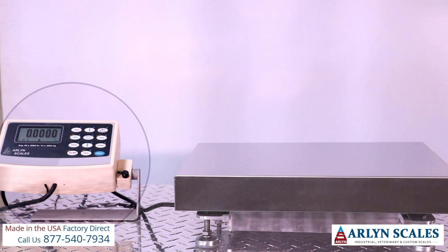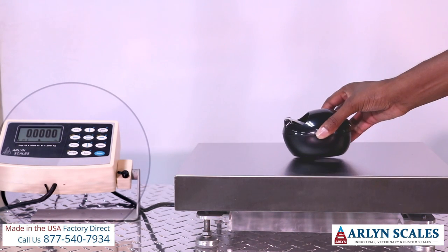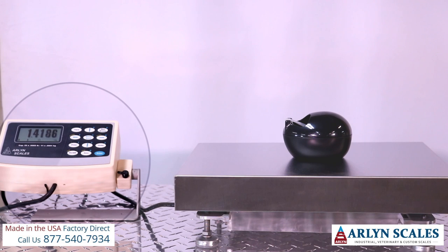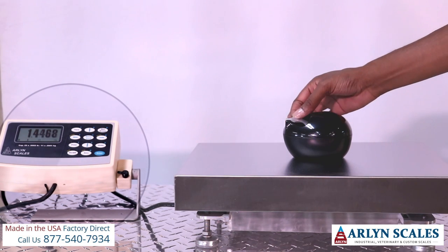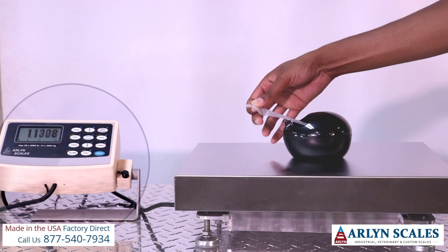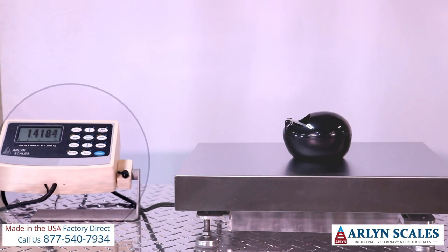Alright, so let's measure this tape dispenser just to show how very sensitive the Ultra Precision Scale is. Take away this piece of tape and as you can see it registered the difference.